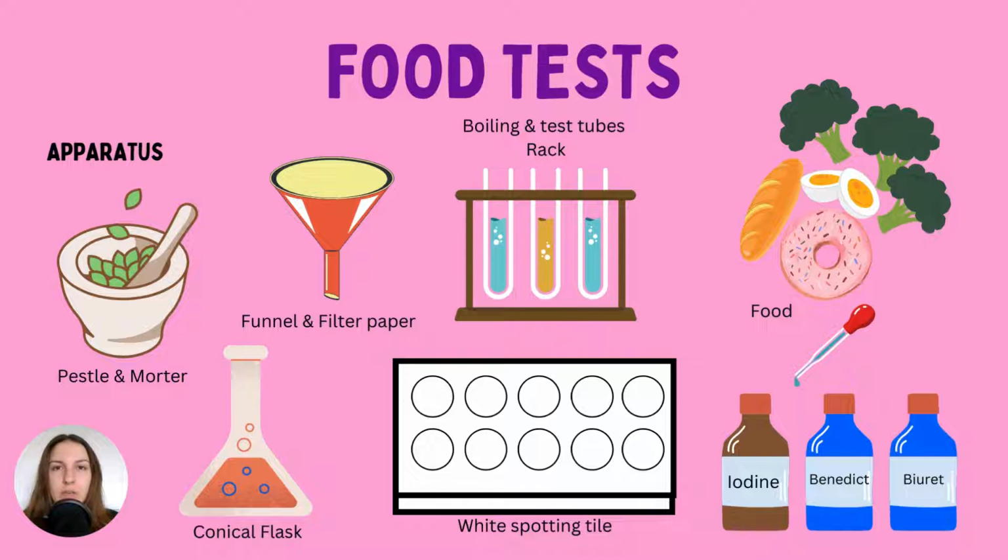Boiling tubes, because we're going to be heating one of the reagents up in a water bath, and therefore you'll need a bit of a stronger, thicker, and larger tube so you can actually do that. A pestle and mortar you may need, depending on whether your technicians and your teachers have kindly done this for you at the beginning. I'll explain in a moment. You may not actually use this in class, but in the practical write-up and the method, you definitely need to use that, and I'll explain why in a moment.